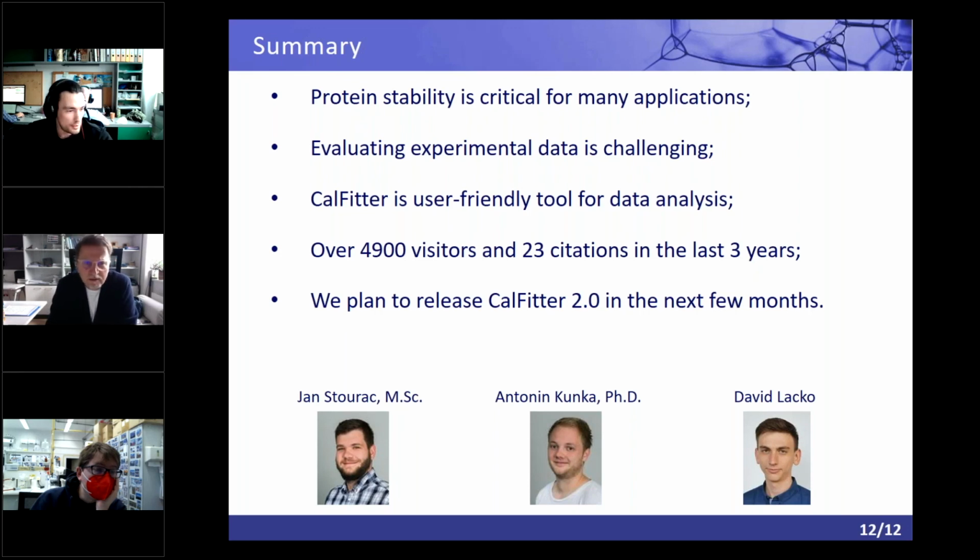In terms of data quality, it's really on the user side. So CalFitter will take anything and it will try to fit anything. And we also implemented some correction, because you might have 2 different types of data, one with a lot of noise, for instance, and one with a very small noise distribution or many data points. Since CalFitter fits globally into those data sets, it also reweights different measurements based on the error that is present in the data. So it can handle quite flexible types of data.